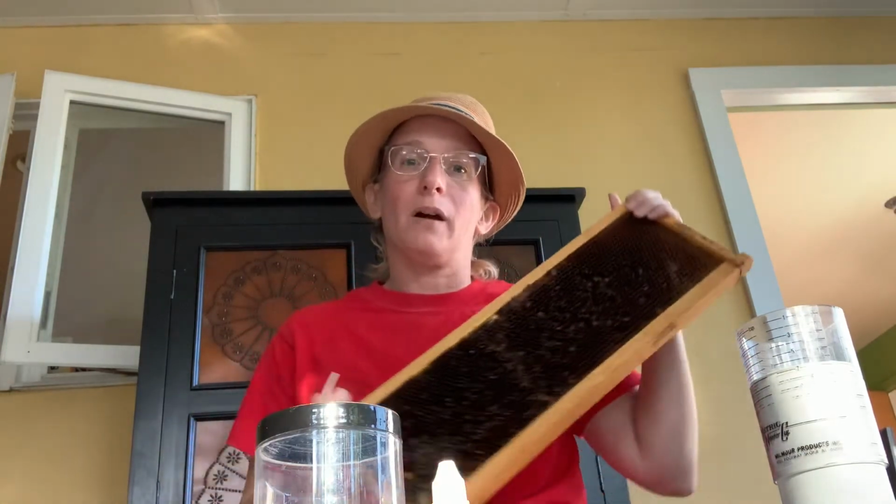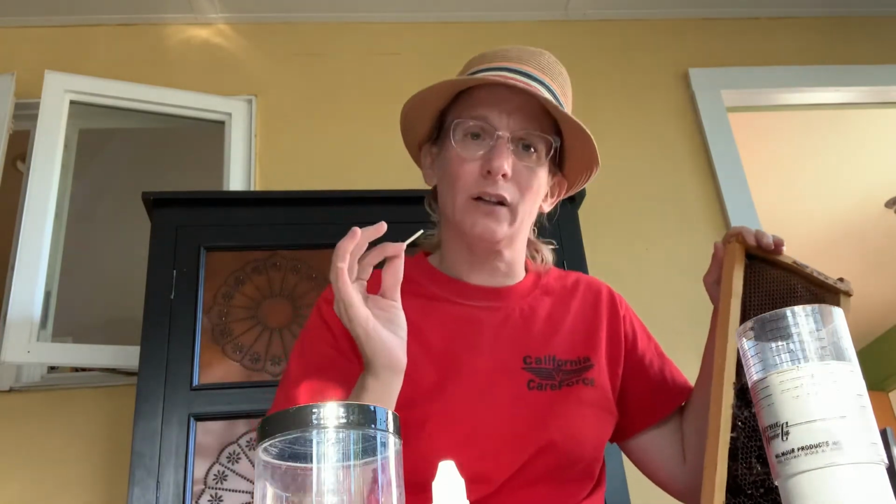Now, normally something is going to adhere a little bit to your matchstick, but if it is American Foulbrood, that adherence will cause the snottiness to pull out in a string, just like when you had that really nasty sneeze, when you had the flu. It's going to pull out in a nasty looking caramel colored string that's about 3/4 of an inch long or 2 centimeters long. Basically nothing else does that. If you have European Foulbrood, it might look snotty and darkened and smell bad, but it's not going to do this stringy thing that we're talking about here.